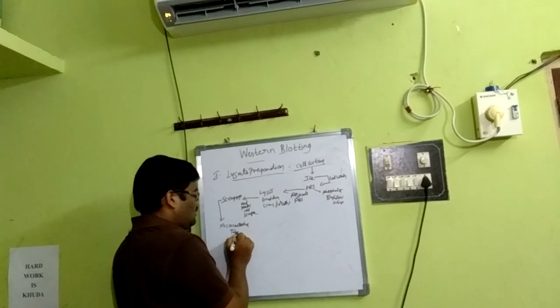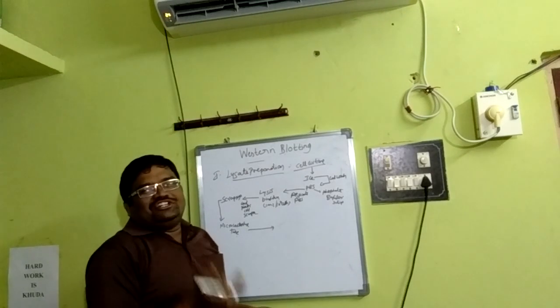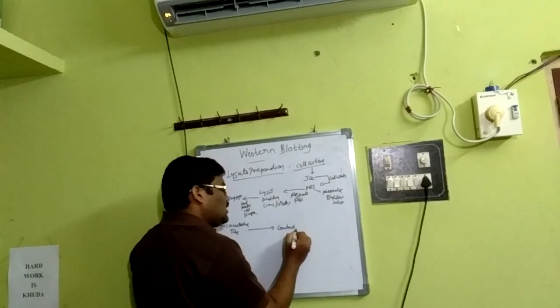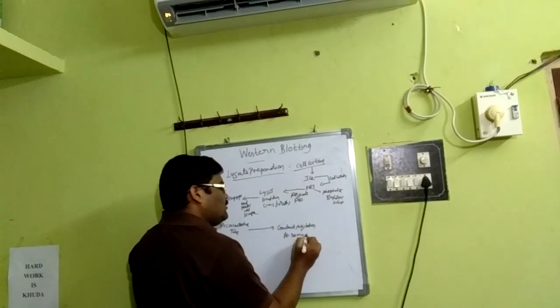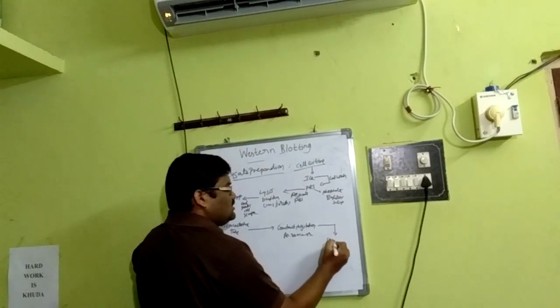Now after that, subject the same to constant agitation for 30 minutes at 4 degrees centigrade. Then centrifuge.